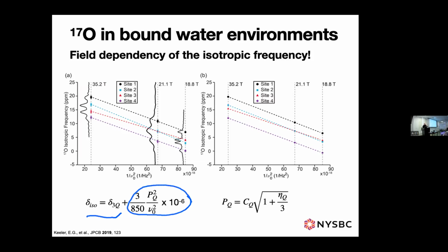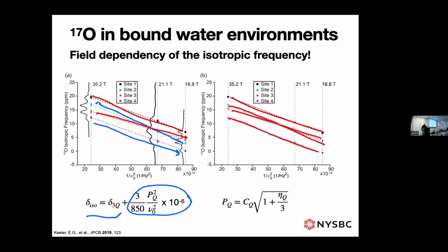And as you can see, you can follow each of these peaks as they move through the space experimentally. And then here are just the calculations that I did, which show pretty much the same thing. So I'll get rid of those.